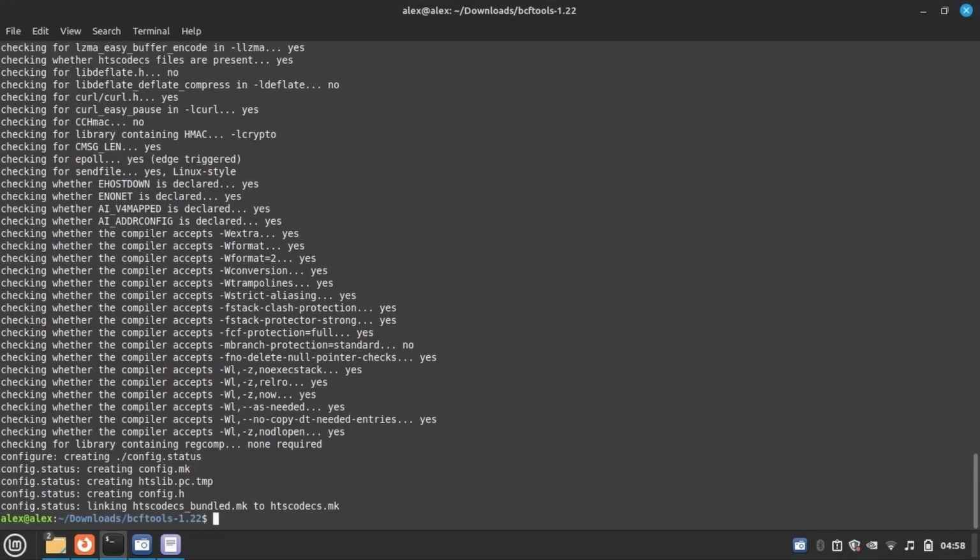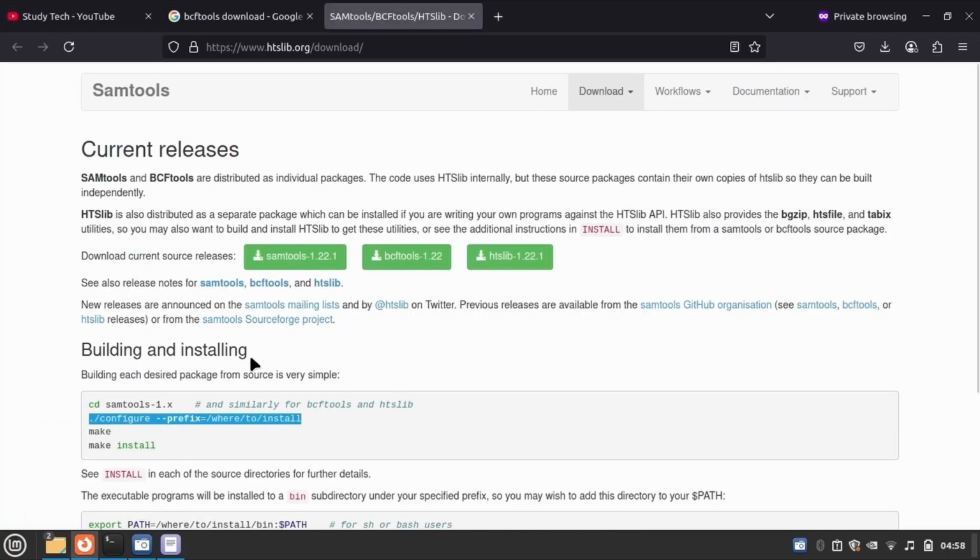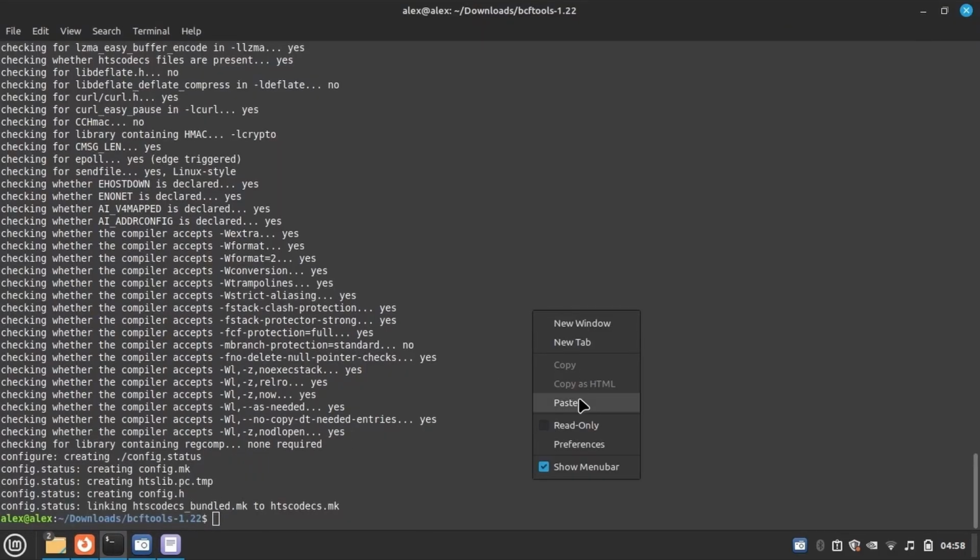So it is installing. Okay, so the next step is make, enter.